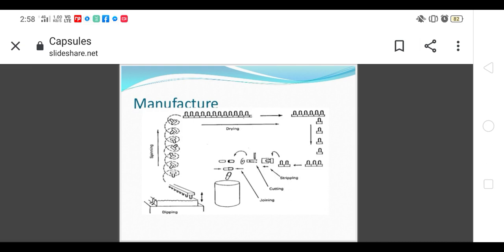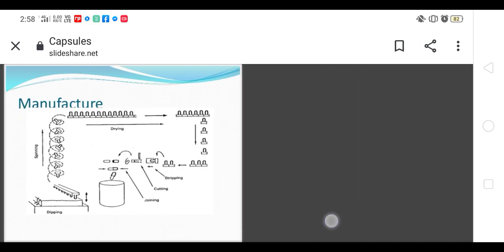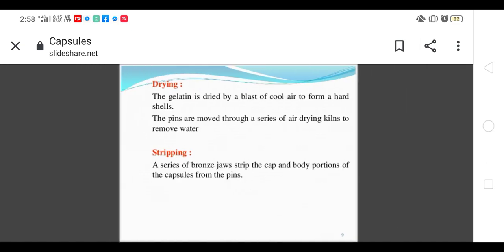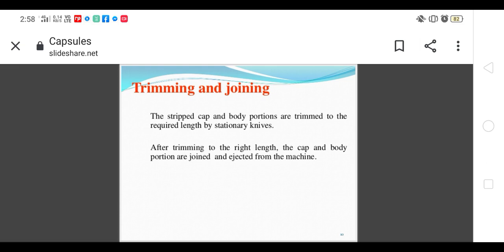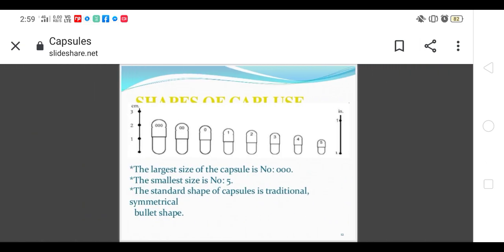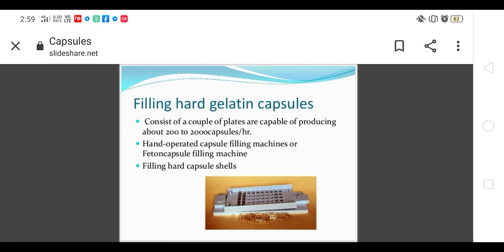After trimming and joining, there are different capsule sizes between 5 and triple zero. This is also available in my previous videos. Today we are going to continue with filling of hard gelatin capsules.